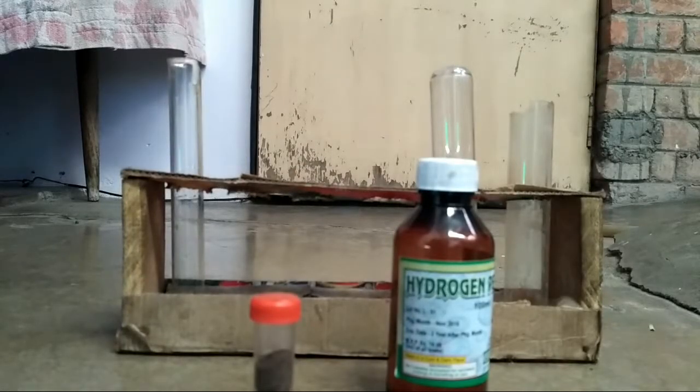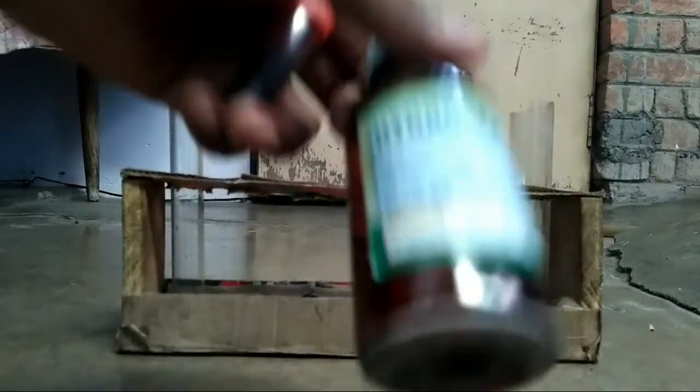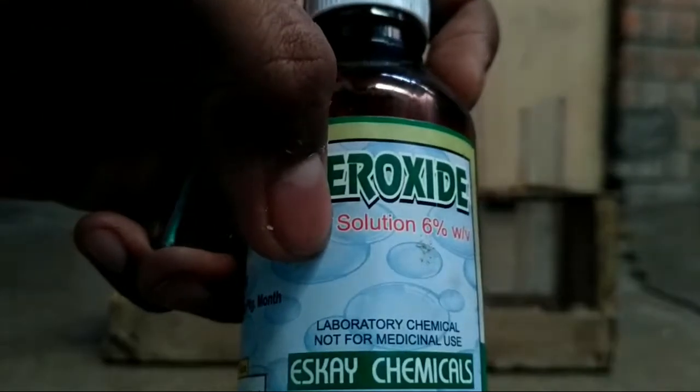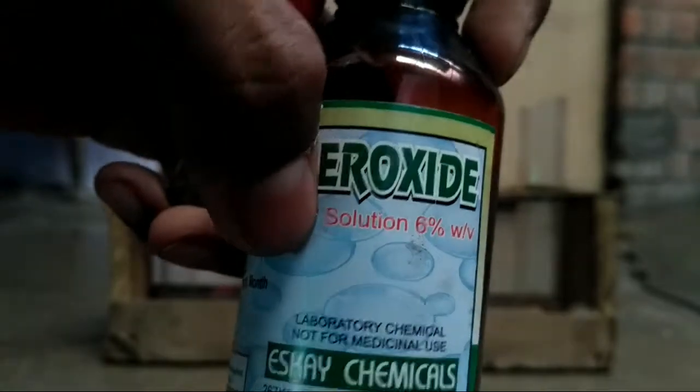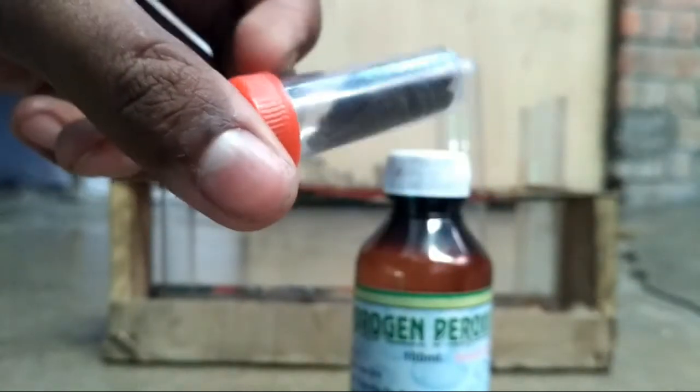Now in this video I am going to show you preparation of oxygen gas. For this I am using hydrogen peroxide that I have purchased from a medical shop, that is 6% by weight, and manganese dioxide MnO2.